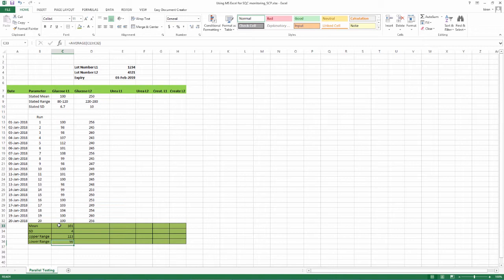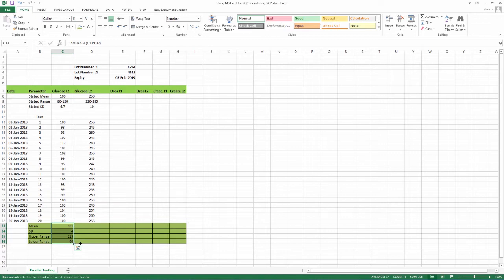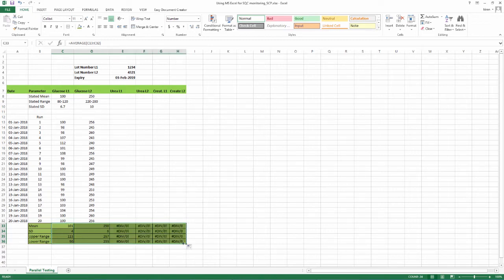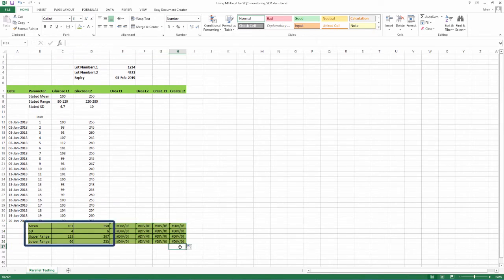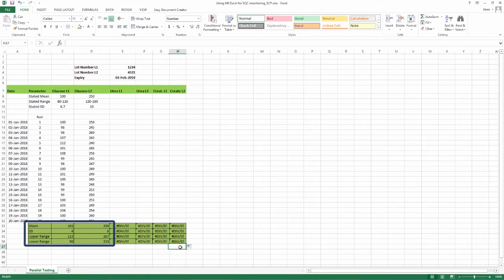You can now drag the formula to automatically calculate the mean, SD, upper and lower limits of all analytes by doing this. Select all the four rows where we have inserted the formula. Go to the bottom right where a plus sign appears. Keep the cursor pressed and drag this plus along the bottom of the last row to wherever you have fed your inputs. Your values for mean, SD, upper and lower limits of all analytes appear.